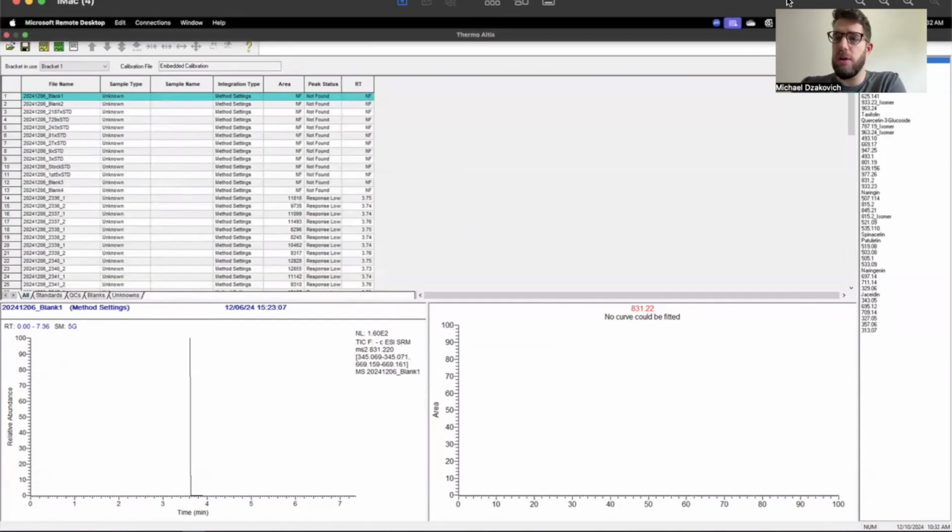Okay, so if you look here on the right-hand side, you can see this list of compounds and masses. The way I set up the processing method is that, instead of using the really long names of the compounds that we're looking at, I just use the nominal mass of the parent compound to give us an abbreviated version of what that compound is.